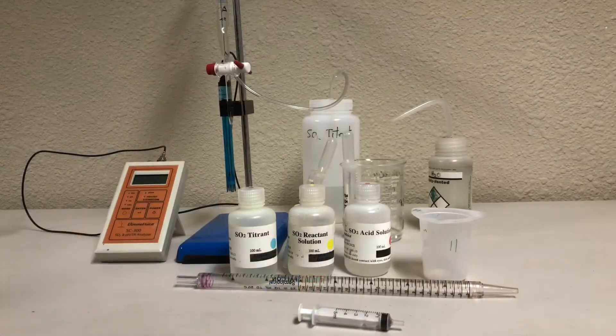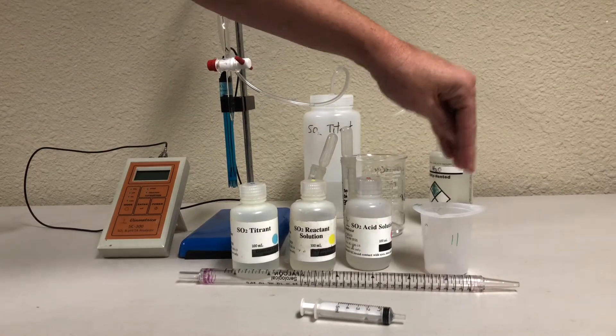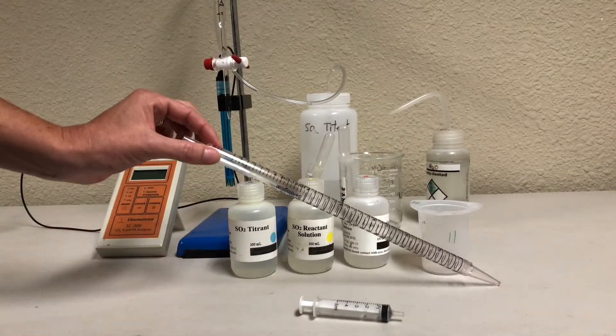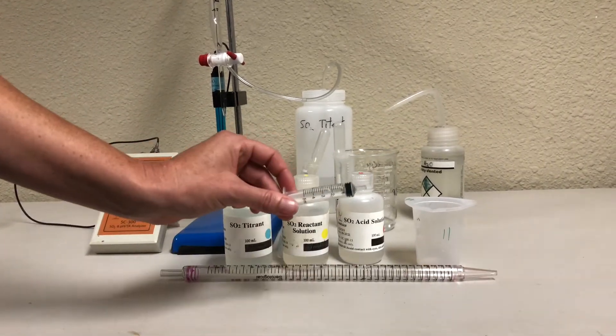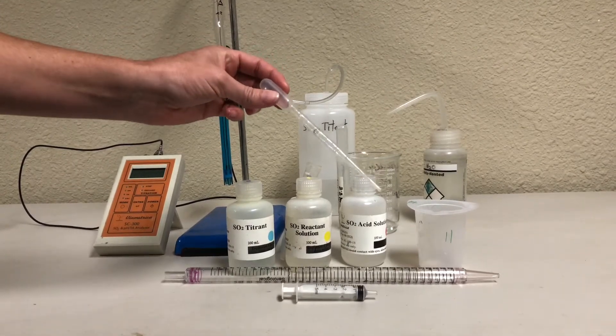To test for free SO2 you will need your three SO2 reagents, your titration beaker for your wine sample, your 25 mil pipette which you use to get your wine sample, a 5 mil syringe, and two 3 mil transfer pipettes.